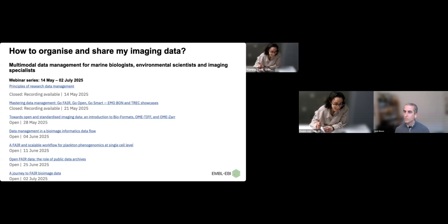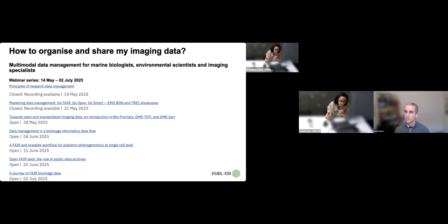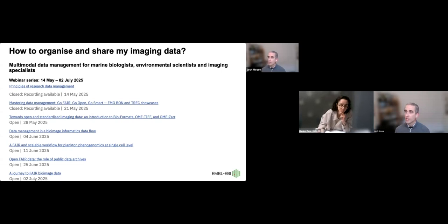Thank you. Then someone else is asking about different file formats that may have more metadata as file attachments, and if there is a plan to include things like this in OME-Zarr. They're mentioning CZI files. So not necessarily concrete plans, Mustafa, but we're getting there.